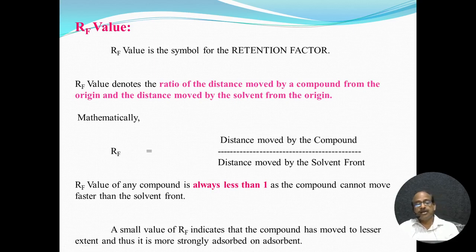Another most important thing: how do we calculate the components present in that chromatography? We have to take the Rf value, retention factor, retardation factor. Rf value is symbolized by the capital R.